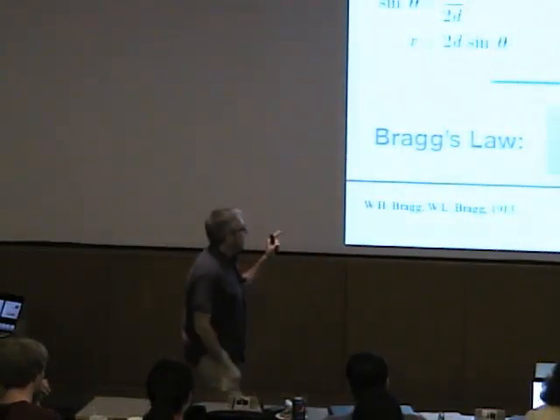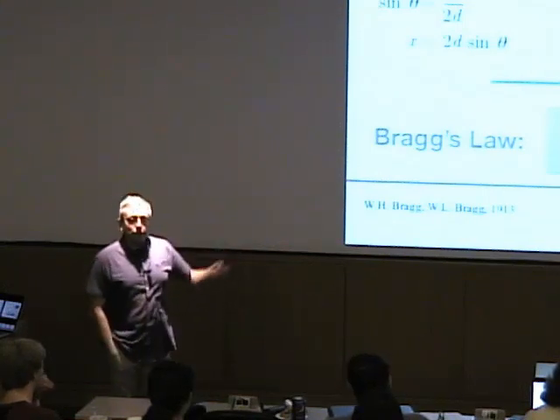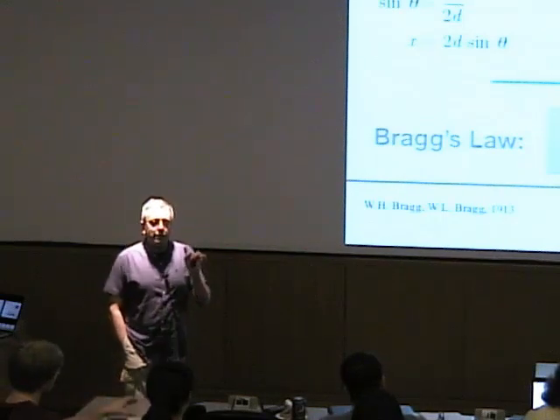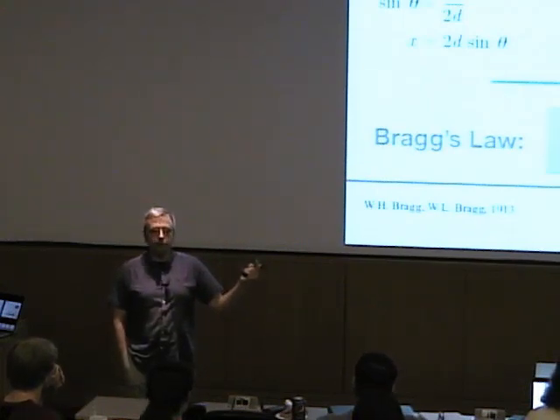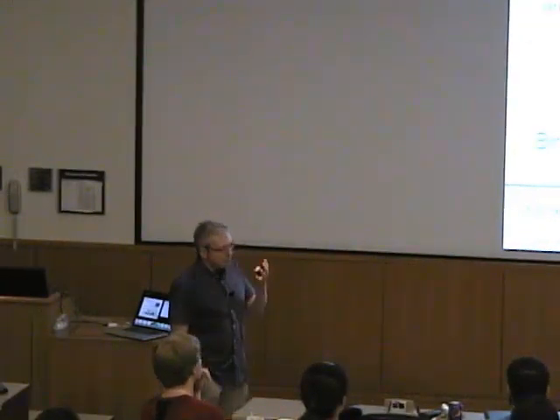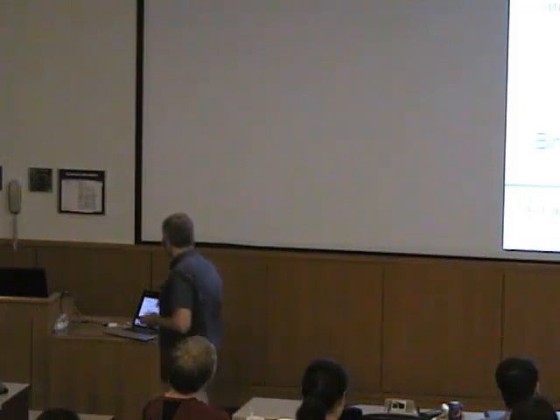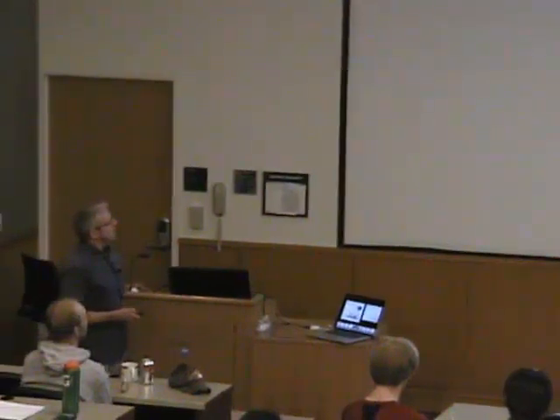But the point is, of course, that this allows you, in fact, to completely relate reflections that you put on a detector to a certain set of lattice planes that come with their own HKL indices. And this is exactly the sorting scheme you need in the end to make the Fourier transform work. And that's all the mathematics you really need for it. Those are the two gentlemen. It's not John Cleese. And they were really some of the founders of crystallography as a science, because from then on it became possible really to work with these kind of things. And from there, just a very quick excursion.